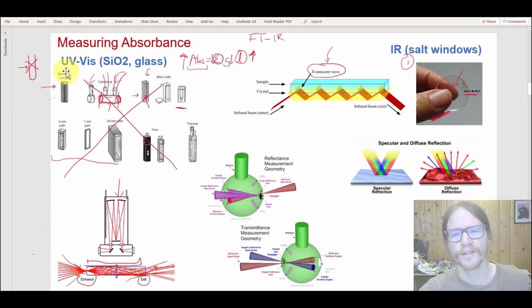And for that reason, you were using this thing that had another hyphenation here. We call it an ATR FTIR, and what that stands for is attenuated total reflectance Fourier transform infrared spectroscopy. The ATR is the sample introduction step. So instead of using this, what you did was take a small drop and put it on the surface of a little window. And what happened there is you've got all your molecules. This is sort of a zoom in of that window.